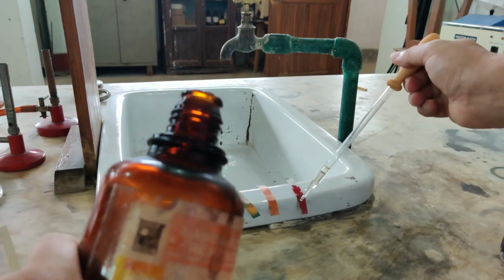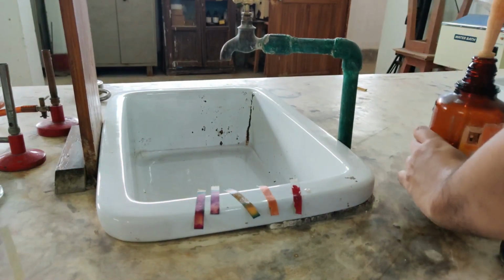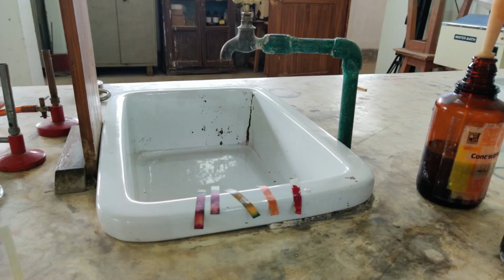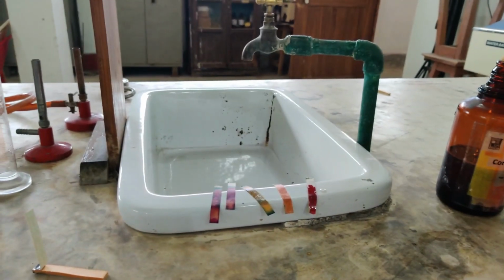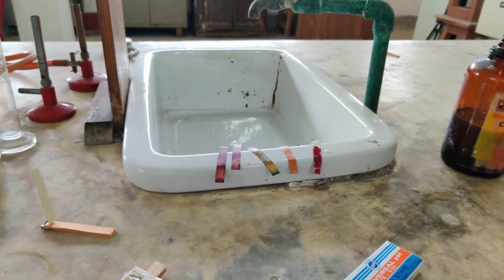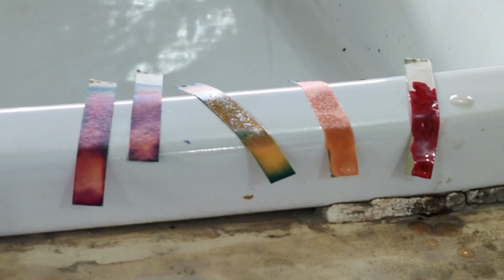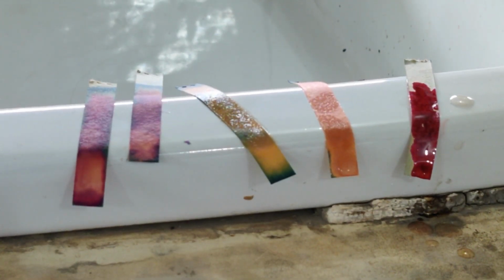Now since it was the same paper, all papers were the same, but you will notice after some time that the color change which has taken place is what is different. Okay, so let me zoom this a little bit. Now see the color change. So you need to dry it and then compare with this paper.